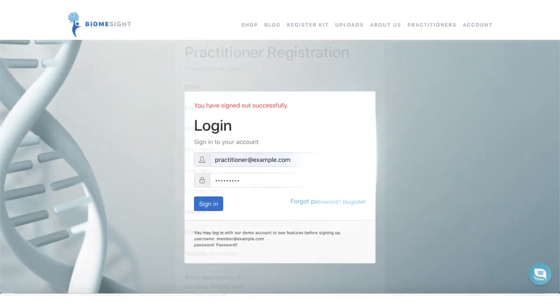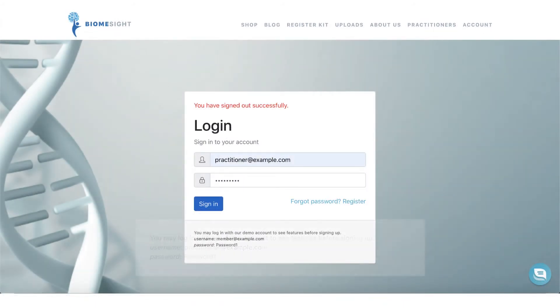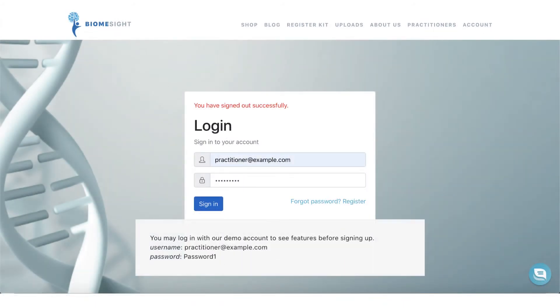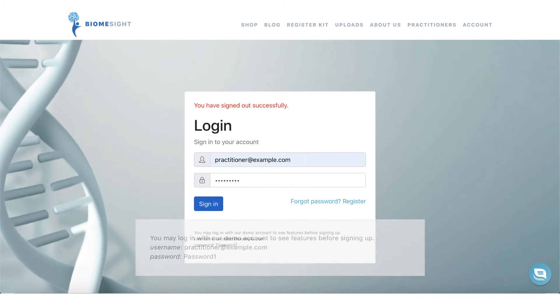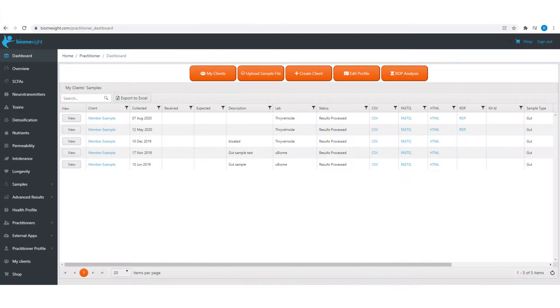I will now demonstrate these features by logging in as the practitioner demo user. Please feel free to log in using this account if you'd like to try the features before joining the program. The practitioner dashboard provides you with a listing and status of your client's samples.